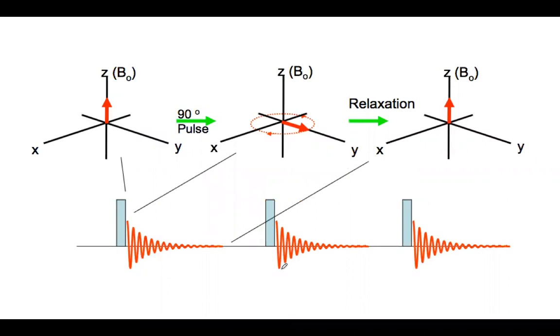We can see then the changes in energy as it goes by. So we have our initial dipole aligned with the magnetic field. Then there is a pulse of energy from the electromagnetic radiation, which gives it enough energy to affect a 90-degree change. Then it relaxes back up again. Initially there's going to be no signal. Then after this pulse, we see that there's a strong signal here, which corresponds to the high amplitude part. And then over time, it relaxes back to its original position, where we have no signal.